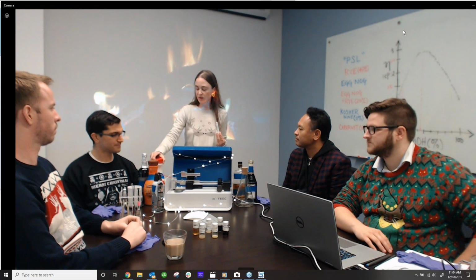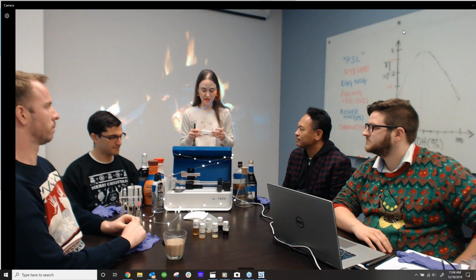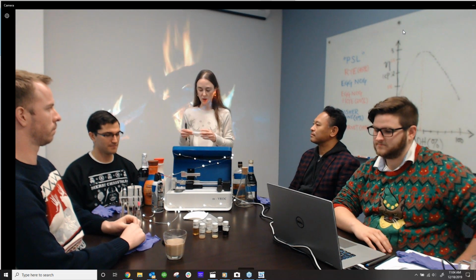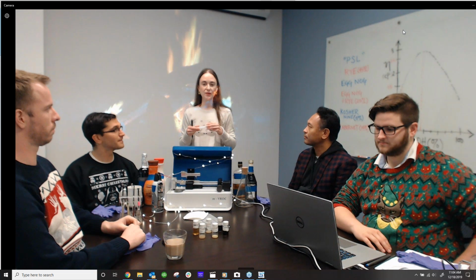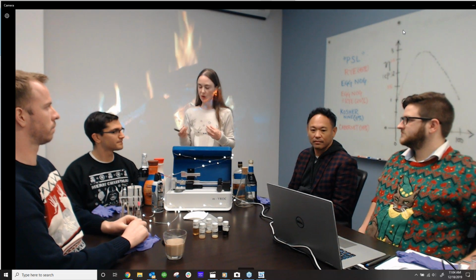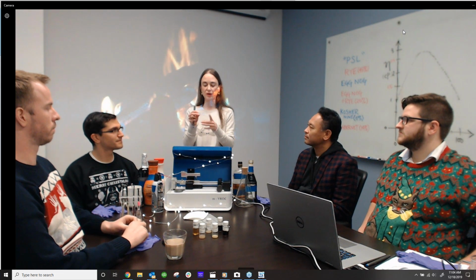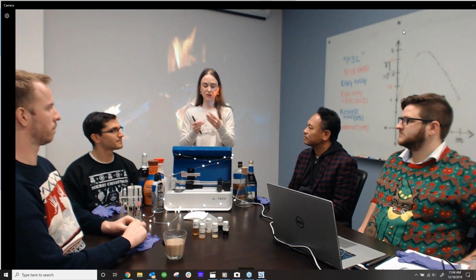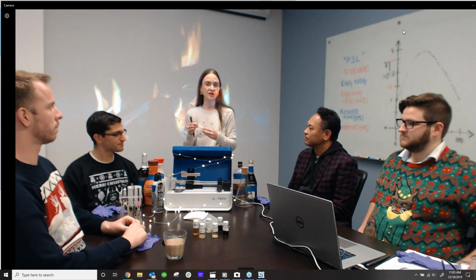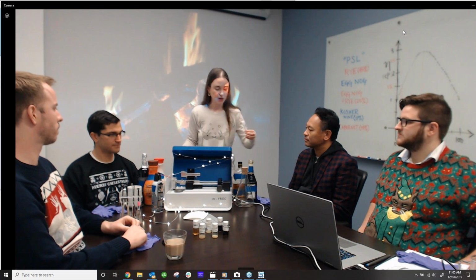when you're dealing with certain beverages where you're adding flavorings like nutmeg, cinnamon, things of that sort, these are large particulates. So remember, we're working with microfluidics. So that we don't clog up the channel, it's best to do some filtering to get that out. This is simple to do. It's very easy. You can just load your syringe with your sample and then pass it through the syringe filter into a vial and then load it up into the test syringe. So we always recommend that when you have particulates such as the nutmeg.